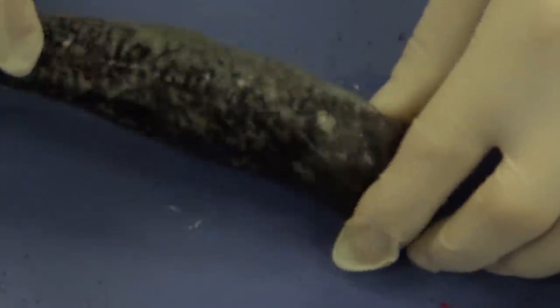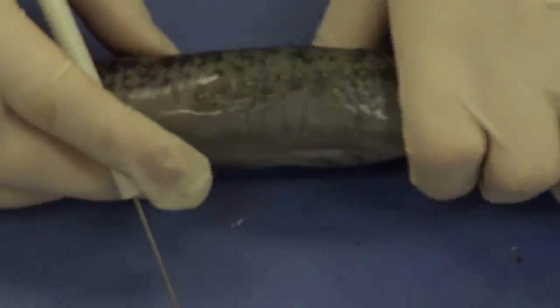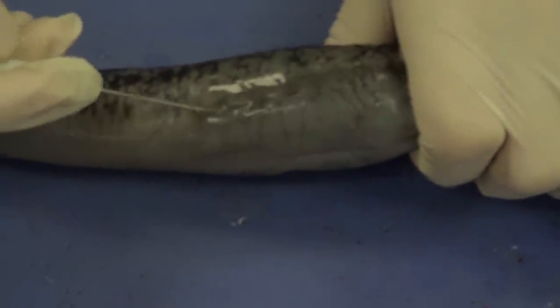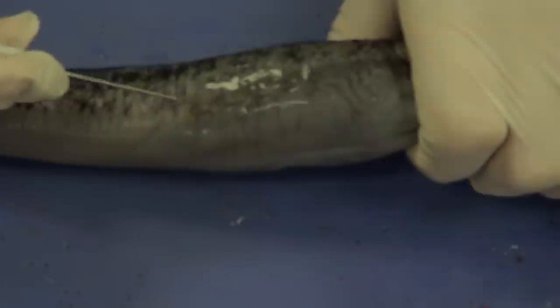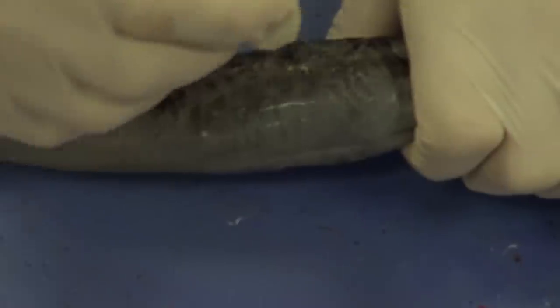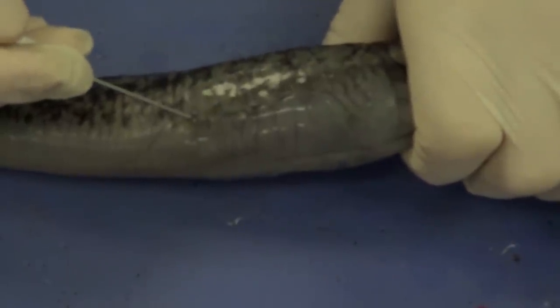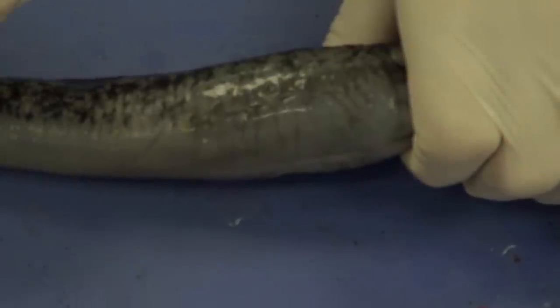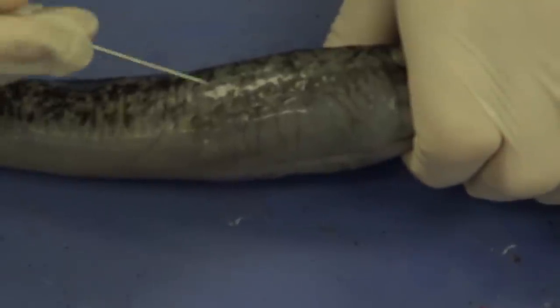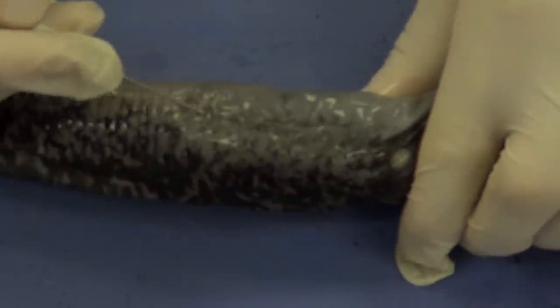If we look at this area right here, we can see there are some additional holes. If we count them — one, two, three, four, five, six, and seven — these holes are referred to as external gills. That's where water is actually going to enter the lamprey and where gas exchange is going to occur inside. So these are external gills, and we have those same external gills on the other side as well.